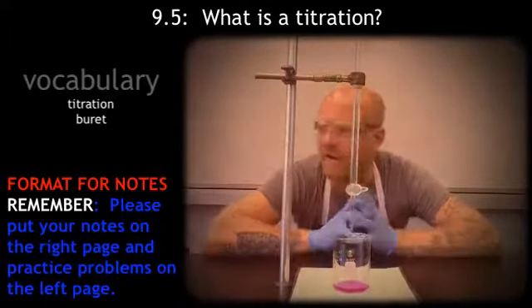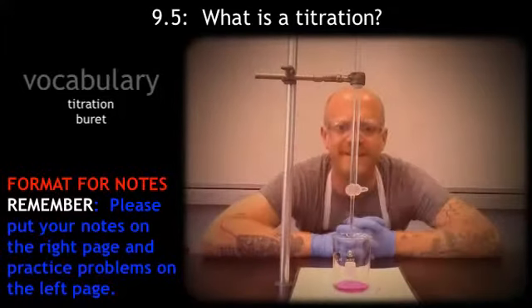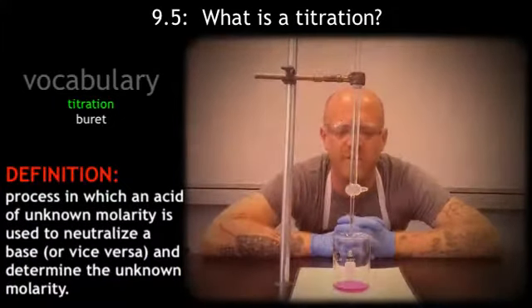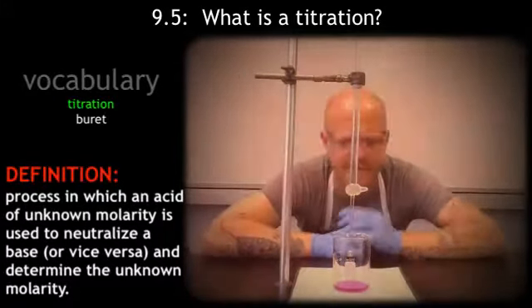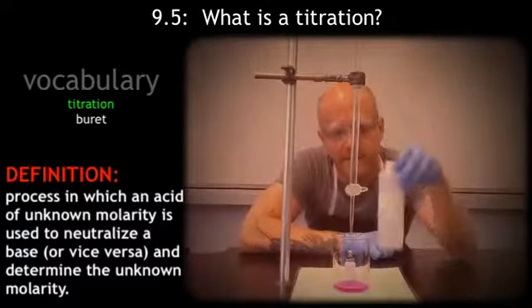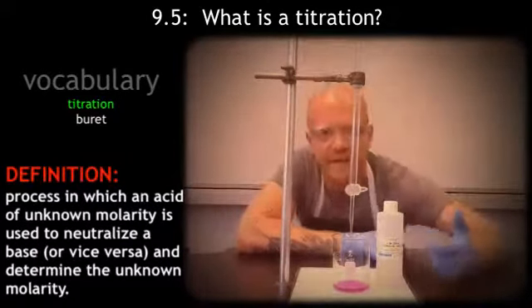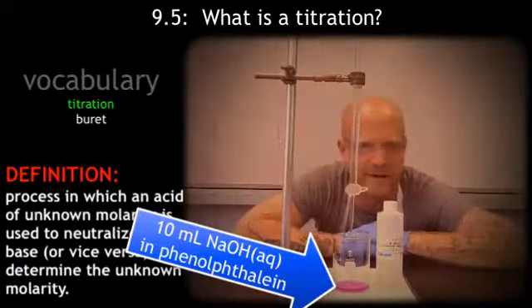Hey, today I'm going to talk about titrations. A titration is when you neutralize an acid and base. And typically what we're going to do, at least for this example, is I have some sodium hydroxide, and I know exactly what I used. I used a 1 molar solution of sodium hydroxide, and I have 10 milliliters in there.